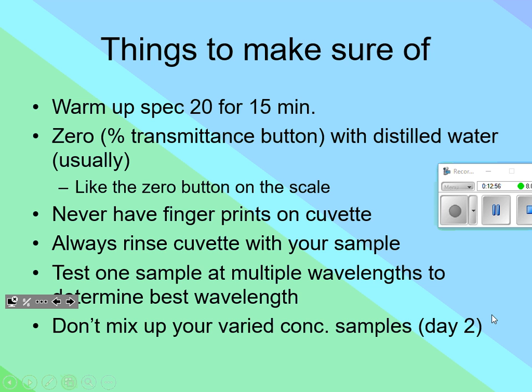What we're going to do today is the second to last bullet point. We're going to test one sample at multiple wavelengths to determine the best wavelength. Day 2, we're going to test a lot of different concentrations of solutions instead. So what I'd like you to do is have out the lab packet that you picked up on the way in.